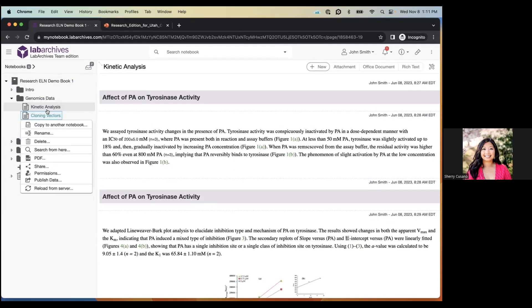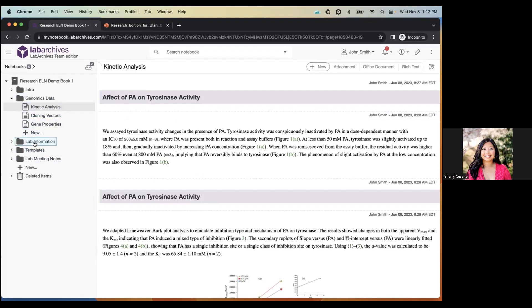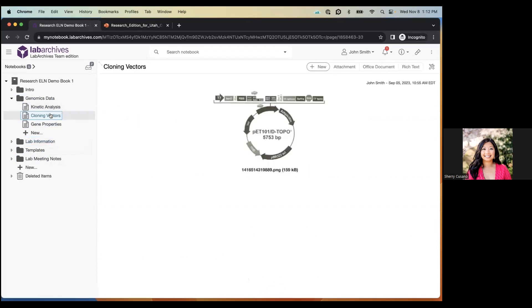On the left-hand side is the notebook directory — the structure of your notebook — showing the notebook name, all folders, subfolders, and pages. If you right-click on a page or folder, you'll see options to copy, rename, or delete. Nothing is ever permanently deleted in Lab Archives; there's a revision history of everything, which is one of the great perks. You can also drag and drop folders to rearrange them.